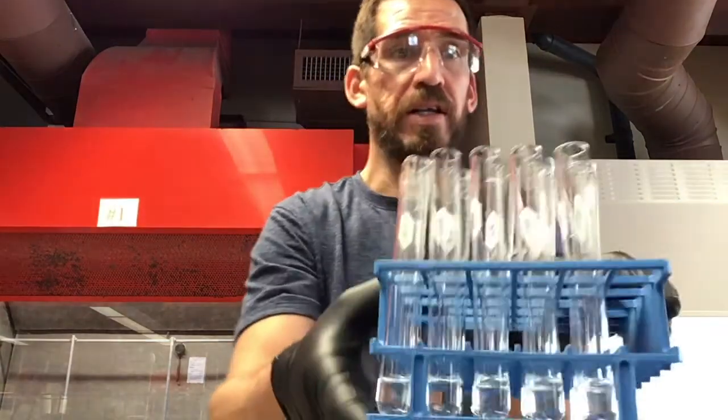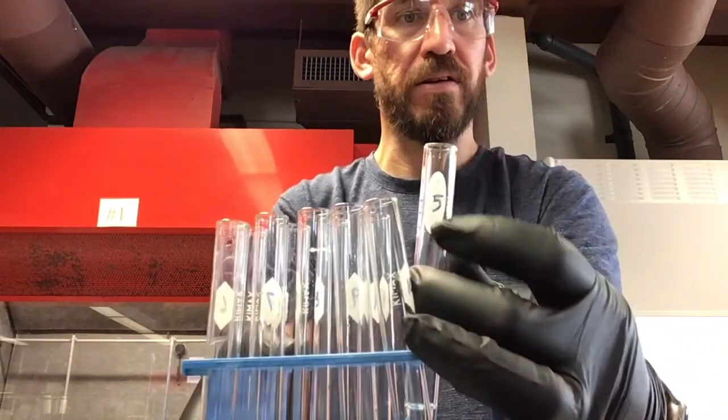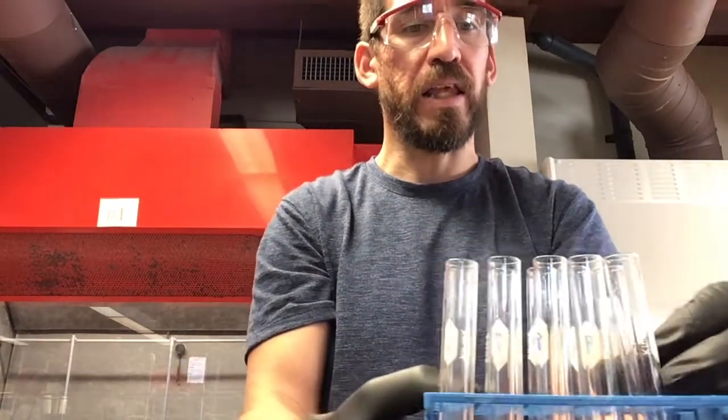So what we're going to do first is the Sn2 condition. What I've actually done is set up 10 test tubes right here, and you can see that I've labeled them numbers 1 through 10. So here's a 5 for you. I labeled them with a Sharpie because it doesn't come off very easily. It does come off. You can hit it with some isopropanol or rubbing alcohol or acetone when you're cleaning your dishes, and it'll come off.